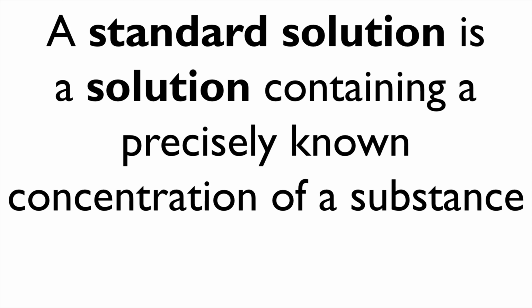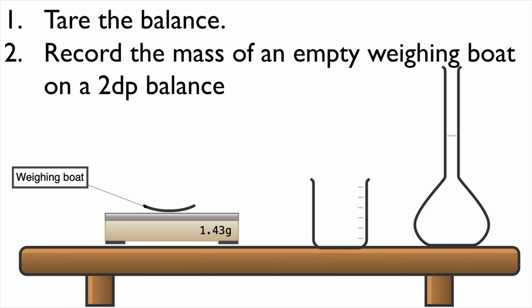So what is a standard solution? Very simply, a standard solution is a solution where we know the exact concentration, and it's made by knowing the exact mass of solid that we've added to an exact known volume of water. So let's have a look at the method.